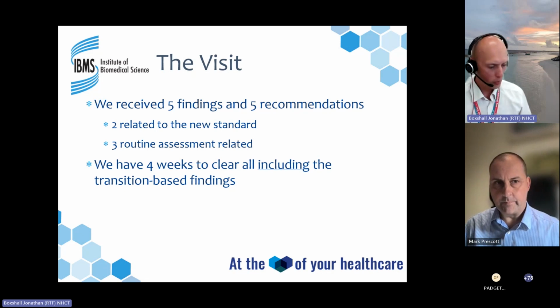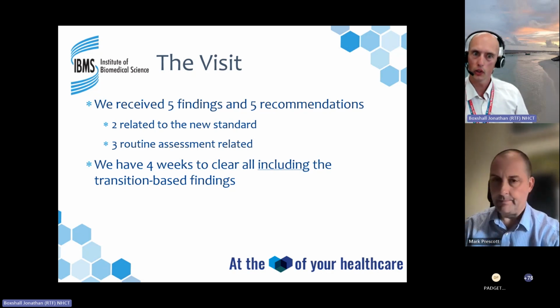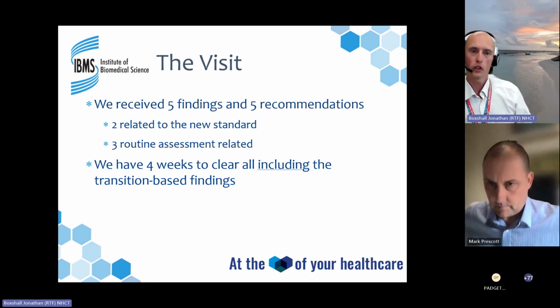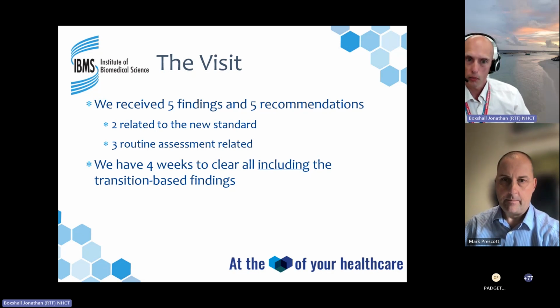So one of our findings is about closure of CAPAs, so I've had to go and do an audit on all of the open CAPAs, so I can then evidence it to say, right, we've got all these CAPAs that are open, we've reviewed them all, have updated target dates, put reasons why, or we'll close them. So you may just say, oh, this one CAPA I've had a problem with, but then I've had to review another 25 or whatever it may be.